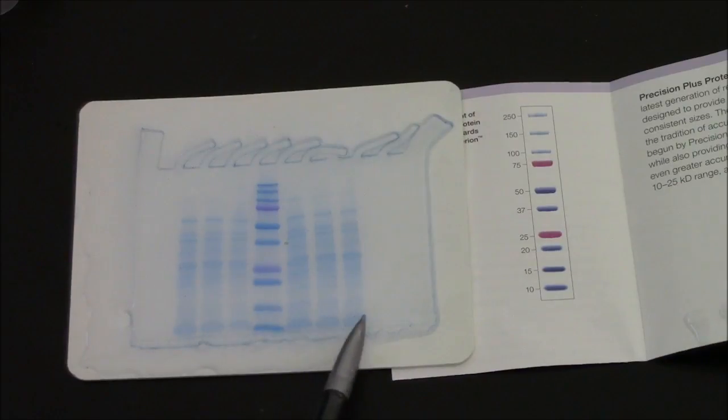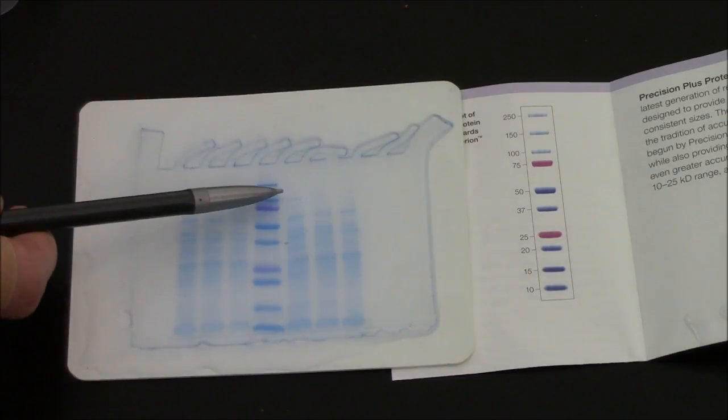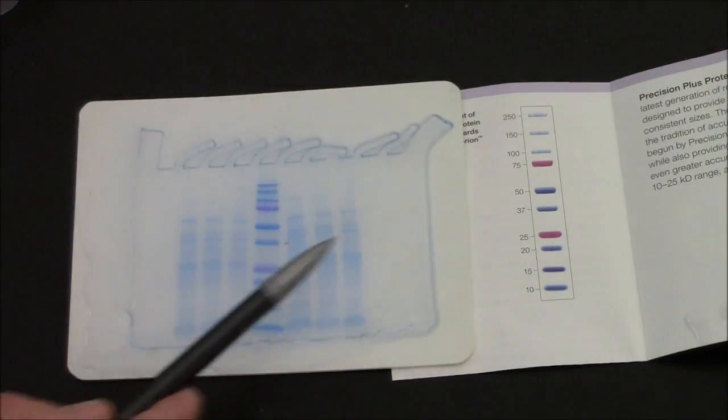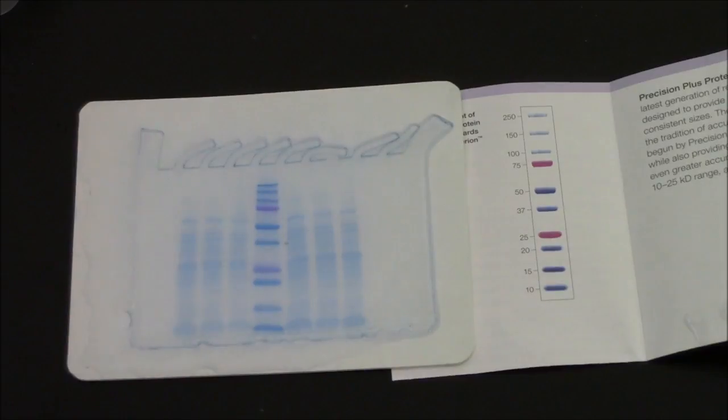Comparing the different groups, they all look about the same. Some groups have more of this high molecular weight protein up here. That's between the 75 and the 100, very close to 100 kilodaltons.